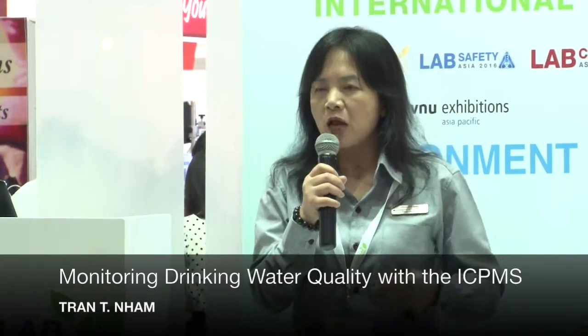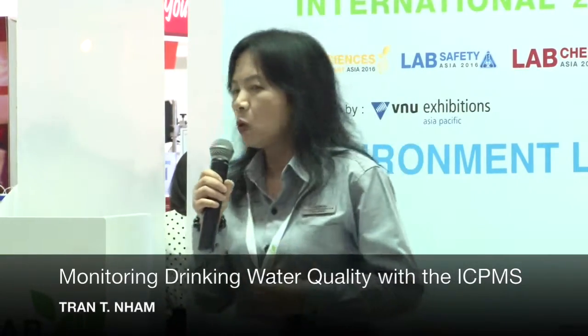Right? To measure the elemental impurity, there are different analytical techniques: graphite furnace atomic absorption, or ICP-OES, inductively coupled plasma optical emission spectrometer, or ICP-MS, inductively coupled plasma mass spectrometer. All these techniques can be used to determine trace metals in drinking water. Now we all know that graphite furnace is a single element technique, so you need to measure one element at a time, and it takes 2 minutes per sample at ppb level. For ICP-OES, the detection limit is about sub-ppb level, while ICP-MS is sub-ppt level.